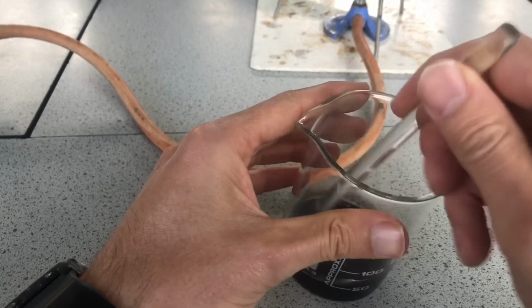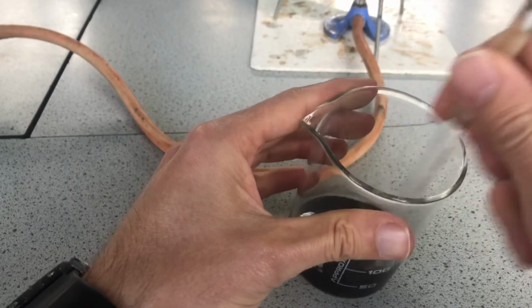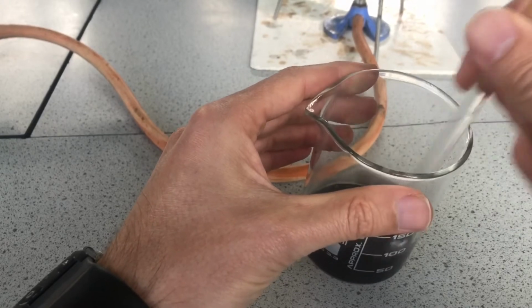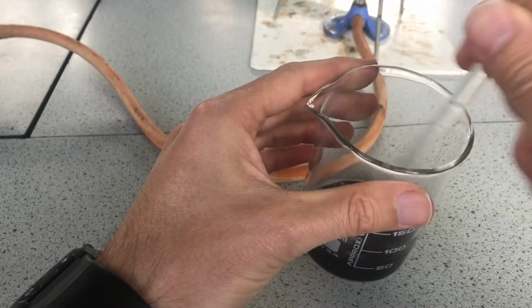Now, the question in the book before we started this was, what are our observations? Well, at the moment, it looks like it's turned black. That's only because we've put so much copper oxide in. So hopefully we'll see some observations when we filter out the copper oxide.